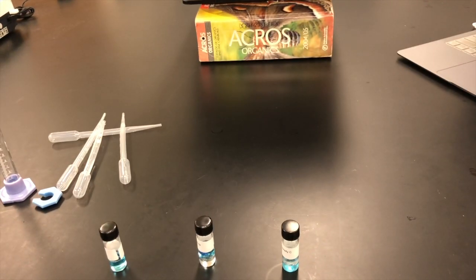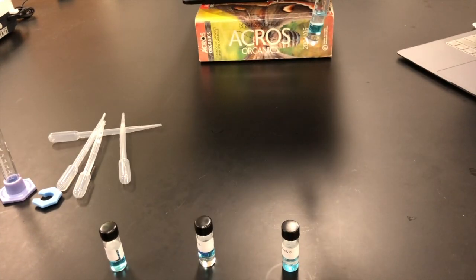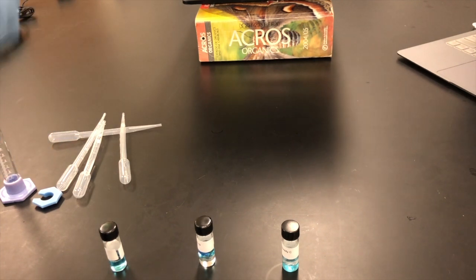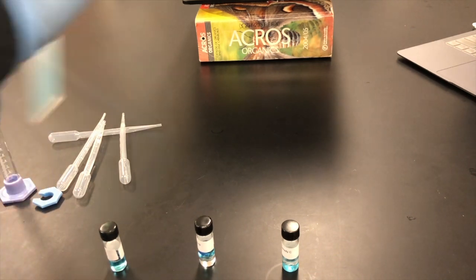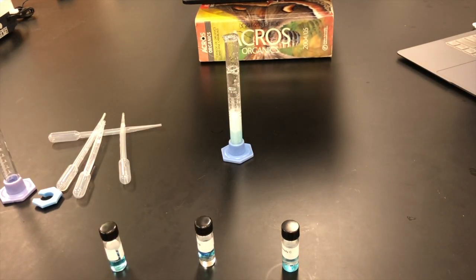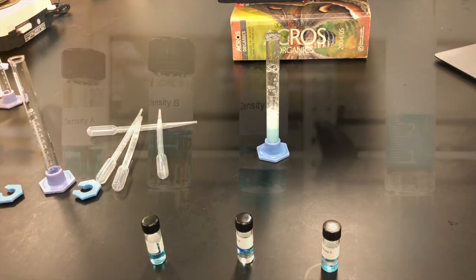And the last thing you want to do is, again, write your observation as to what it looks like. And then shake it. Put a rubber stopper on the test tube and shake it. Make sure it's well mixed. And then just have it settle. And then just wait a few minutes while the solutions start settling.